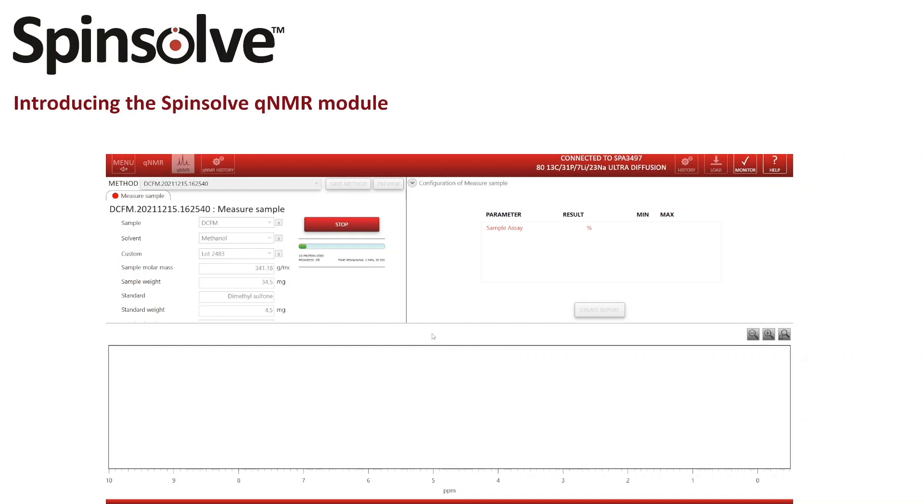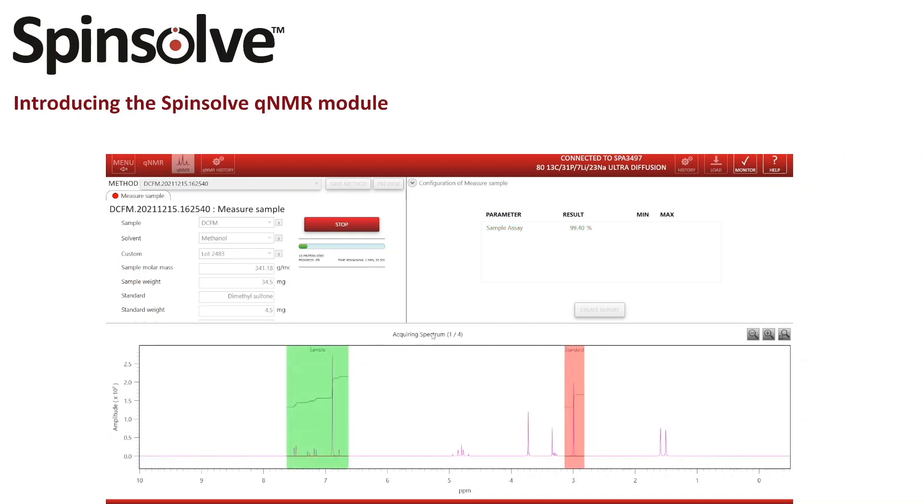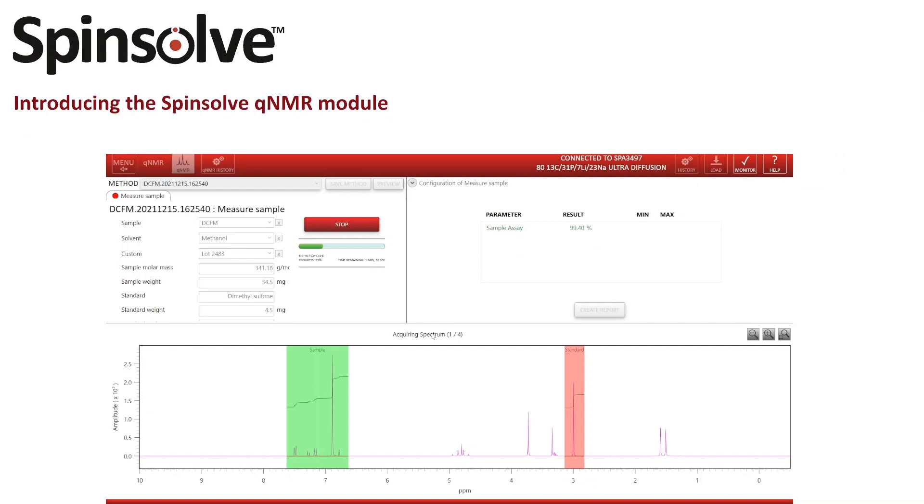While we wait the two minutes for the experiment to finish, I'd like to explain some points. I've chosen the proton experiment with carbon decoupling because with this experiment I don't need to account for different numbers of carbon satellites for the different integral regions, which simplifies the calculation and therefore the setup a lot. With the amount of substance we used in this sample, four scans are enough for a good signal to noise ratio.